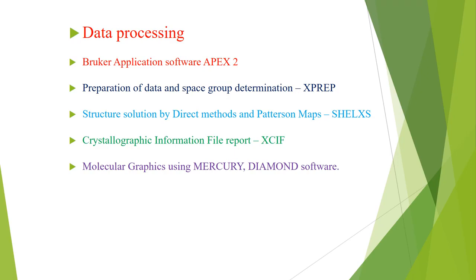Different kinds of instruments, technologies, and software are involved to end up with the determination of the structure of a single crystal. So this is all about our third lecture about single crystal X-ray diffraction.